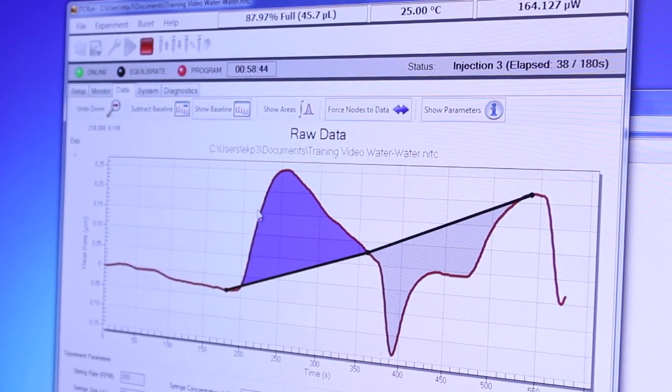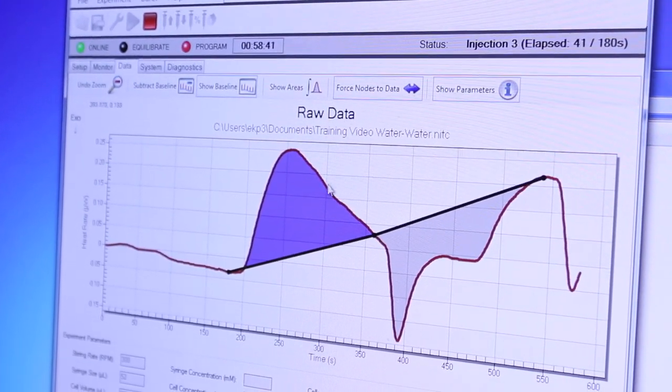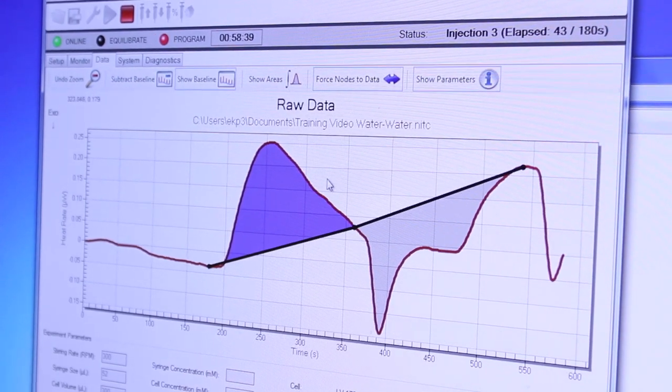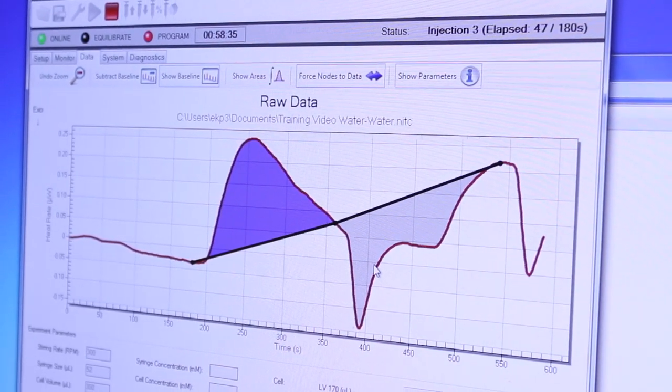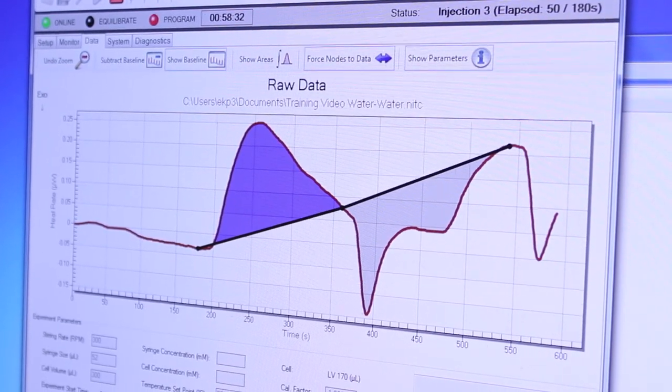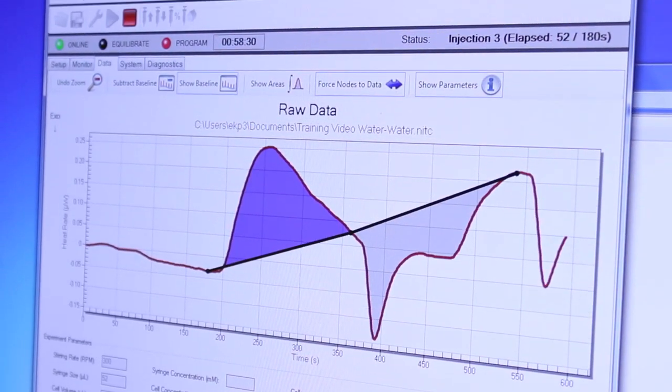At this point on the data tab you can see the actual baseline data that's being collected. It seems that our first injection had a bit of an anomaly there may have been an air bubble or something.